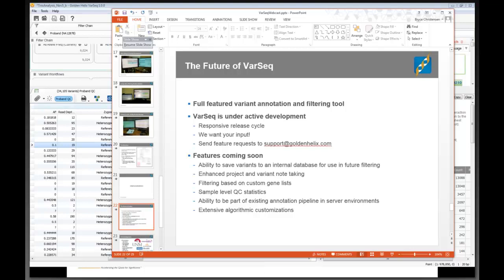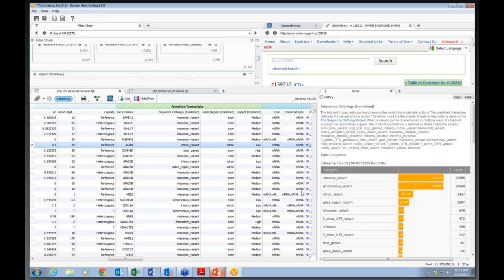Can we compare different trio data in Varseq? Yeah, I didn't show that. The examples I showed here, we just had one trio at a time. You might remember that with the cancer panels, we had multiple probands and we could jump through them. I could have done an analysis where I had several trios imported simultaneously and arranged things a little bit differently to find what was similar from one group to the next. That type of thing is possible.